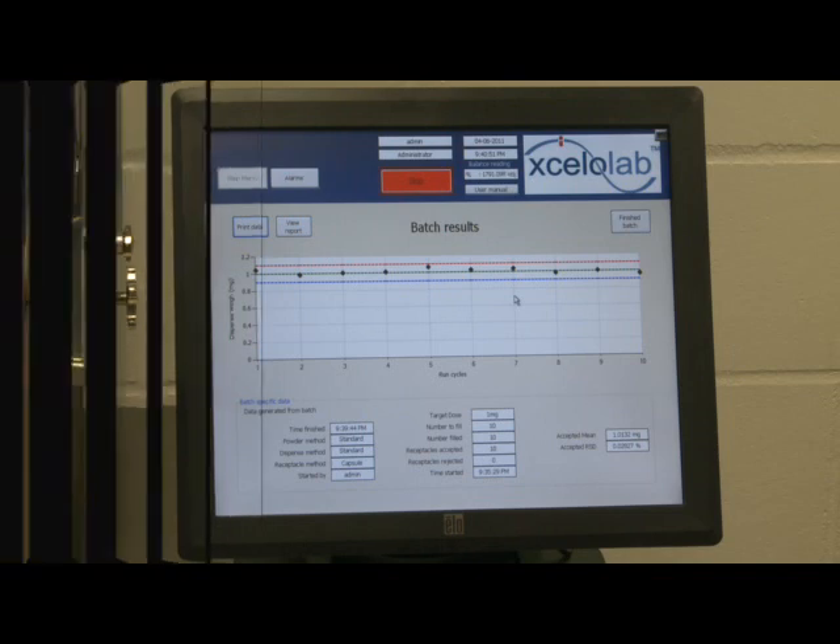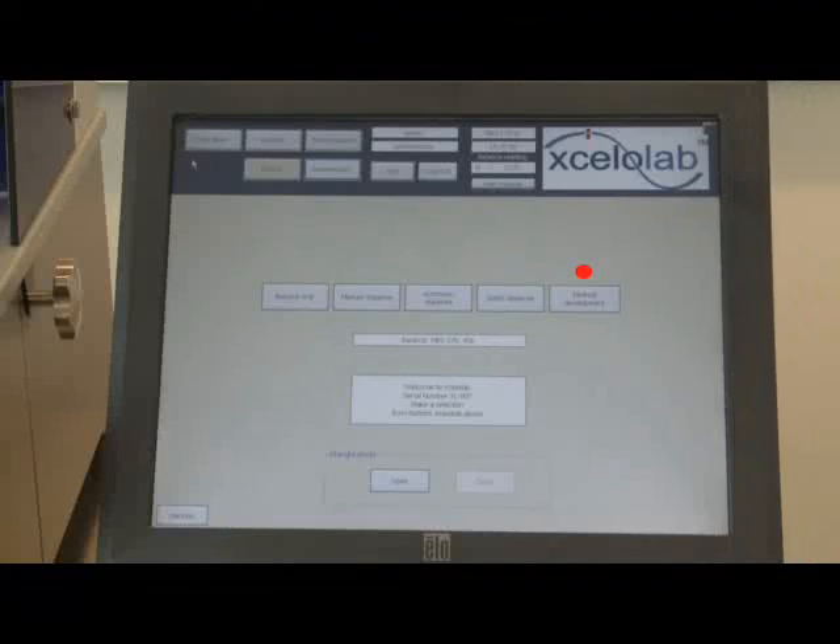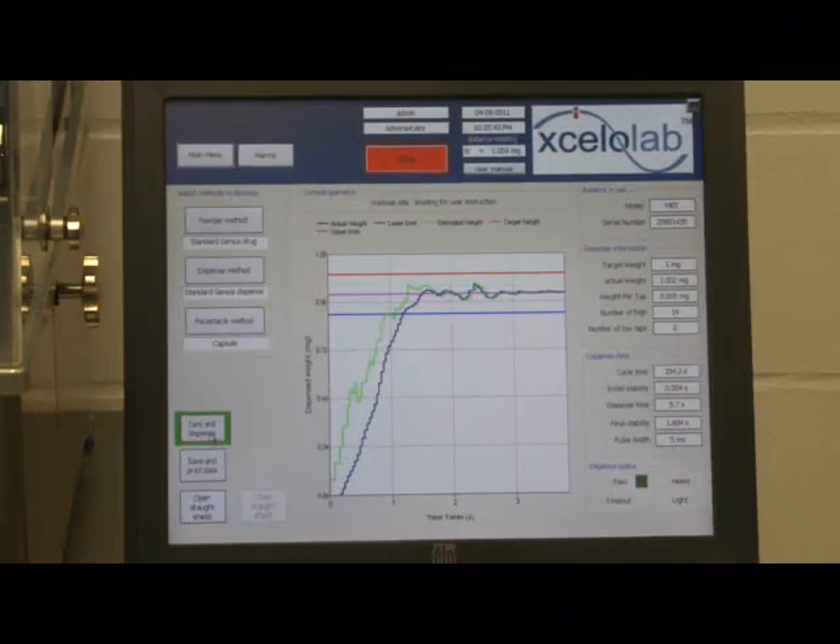The method development mode allows for powder, dispense and receptacle methods to be optimized. A graph shows the characteristics of an individual dispense: the upper limit, lower limit and target weight, the estimated weight and actual weight. Dispense data is also displayed, including the number of high taps and low taps, cycle time, stability settings and cycle and dispense times. The dispense can be repeated or data and graph saved for printing.